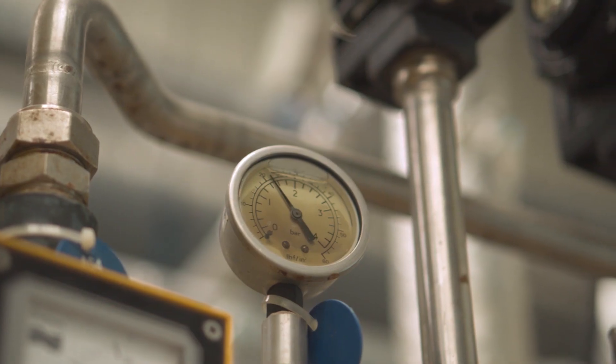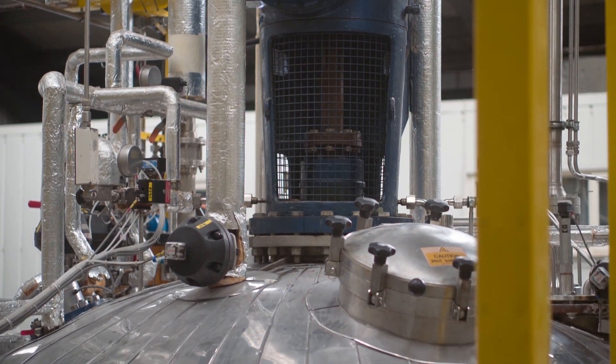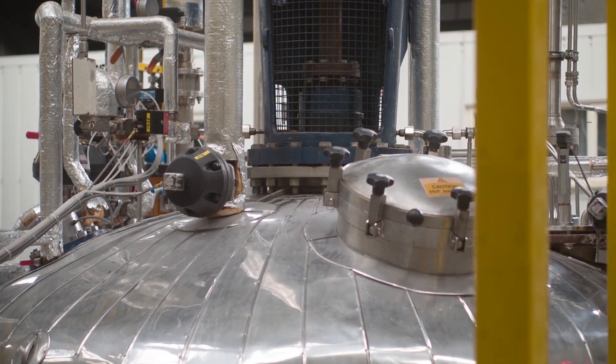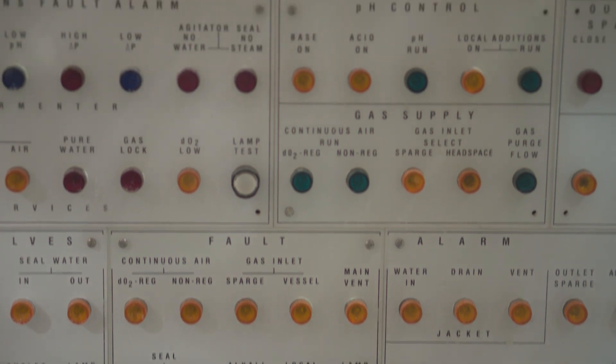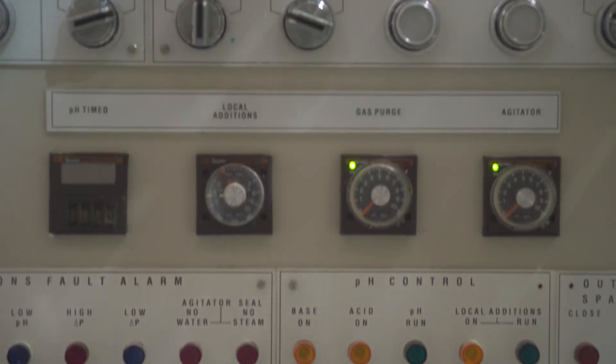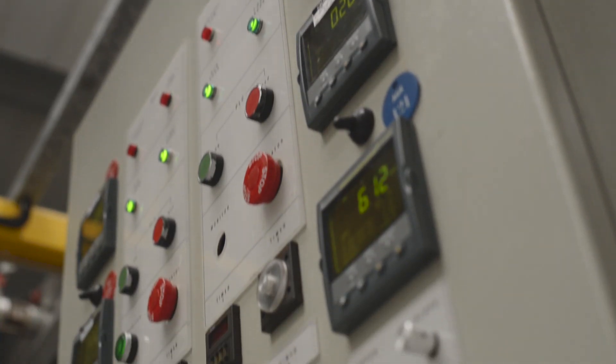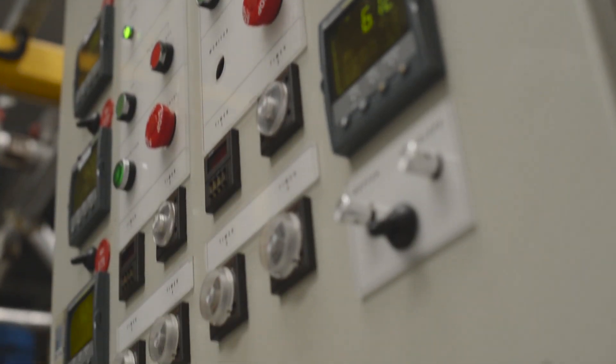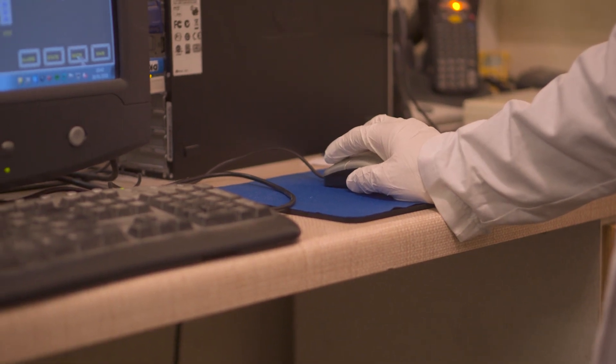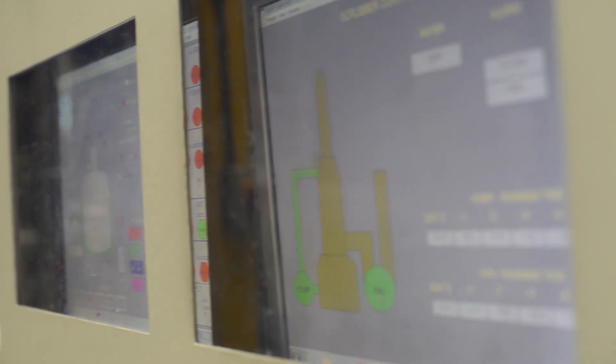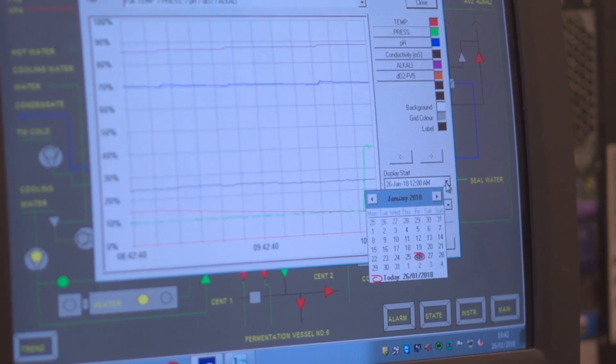Fermenters are run at set temperatures, pH levels, and oxygen levels based on the characteristics of the bacterium being grown at the time. The temperature, pH, and oxygen are controlled automatically via computer control units. The goal is to produce bacteria in their most energetic state and these parameters are crucial. The fermentation time is dependent on the bacterium being produced, but it generally takes 8 to 12 hours, although some bacterium can take days.